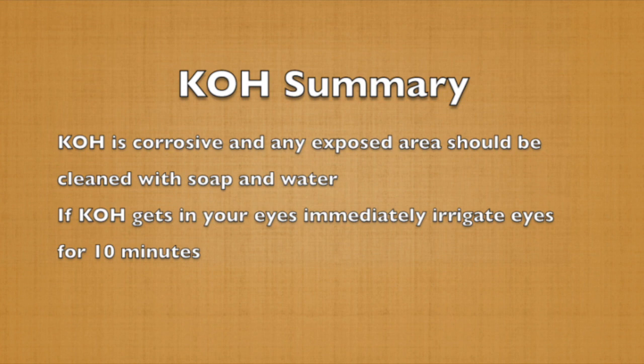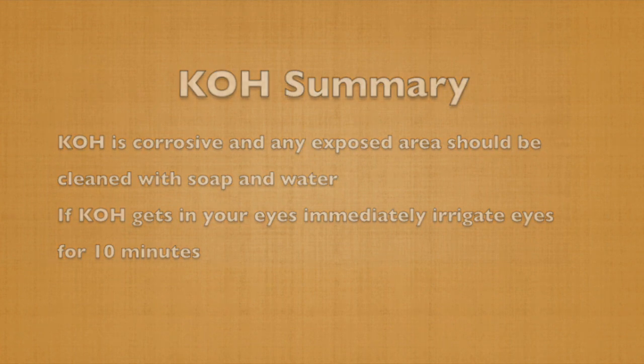If KOH does come in contact with anything other than your lichen, be sure to use soap and water to clean the impacted area. In the unlikely event that it gets into your eyes, immediately irrigate your eyes with water and continue to irrigate for at least 10 minutes.